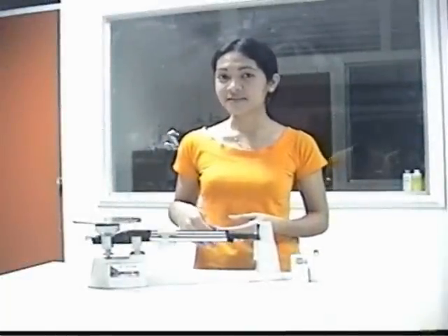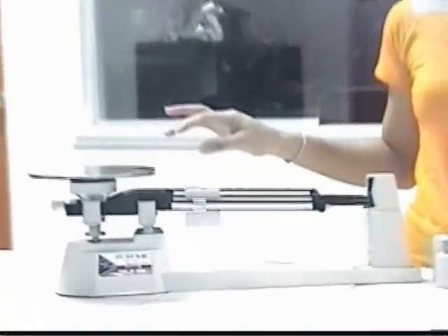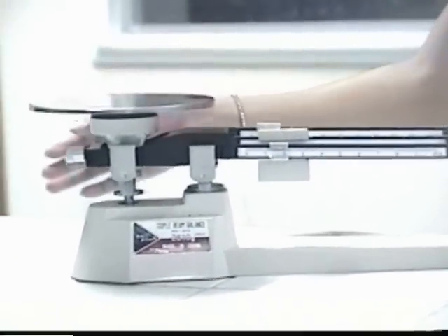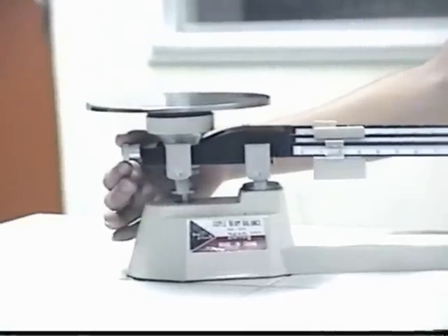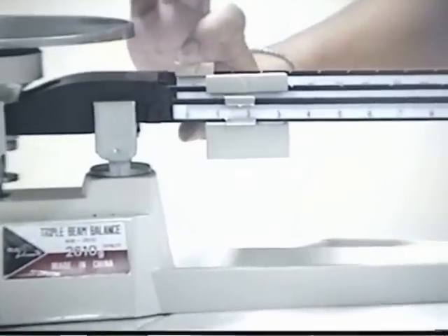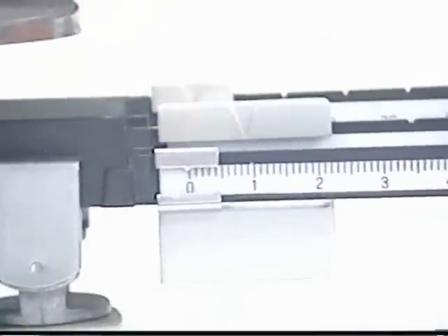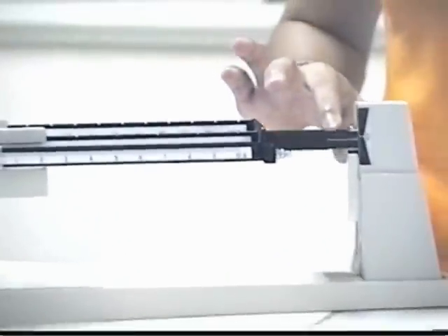Next, I'm going to present to you how to use the Balance. First, zero the balance before you determine the mass of any substance. The first step is to slide all the riders back to zero point. Then the next step is to see that the pointer swings freely along the scale.